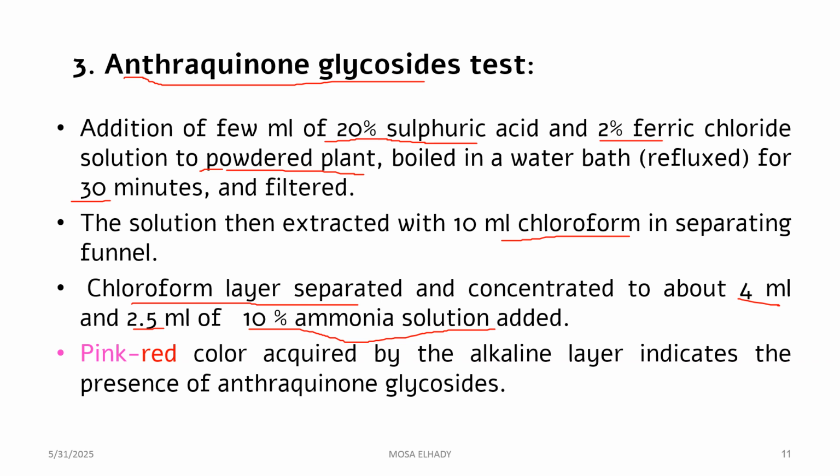The reagent here is 10% ammonium hydroxide solution. In interpretation, the color of the solution can change to pink or red color in the alkaline layer, indicating the presence of anthraquinone glycosides. Note, we have two layers after addition of ammonium hydroxide.